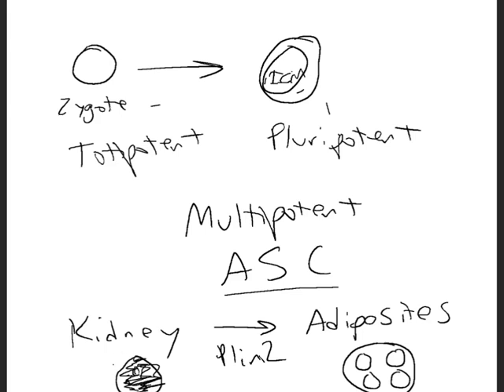and you're going to see most of the cell glowing. However, in the cells that have the PLIN2 gene active, not only are they going to glow, but they're also going to turn on additional genes that have been dormant but still available that will cause the cell to start bringing in and turning the sugars into fats and storing those fats in these lipid droplets. And so what you'll see in the pictures is you'll see these GFP protein, but then you'll see these huge gaps or areas where there's nothing, and they look like just blank spaces, but in reality, those are the lipid nodules that you would typically see in fat cells.